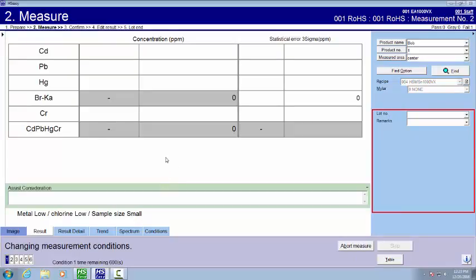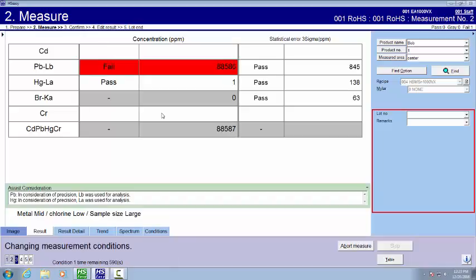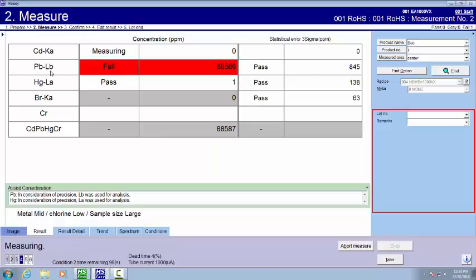While this counts down. This recipe has also been created in a way to shorten the measurement time. ROHS measurements can take quite a while. But you don't always need to go the full measurement time. For example, the lead in this is quite high.